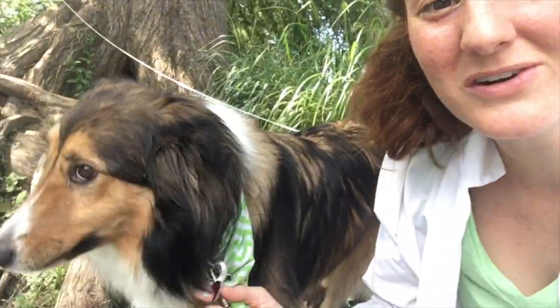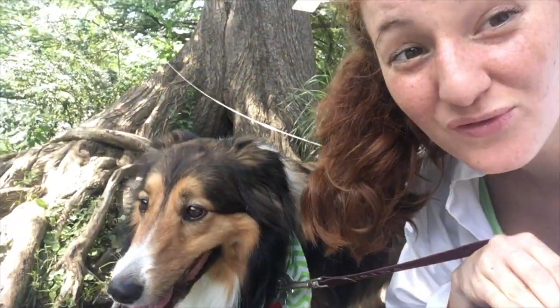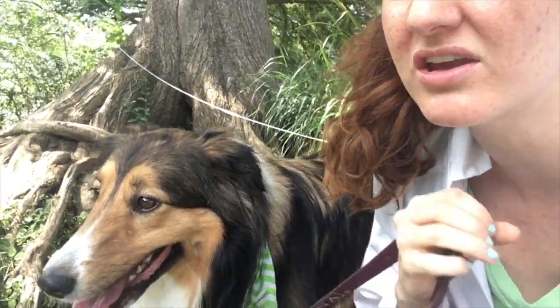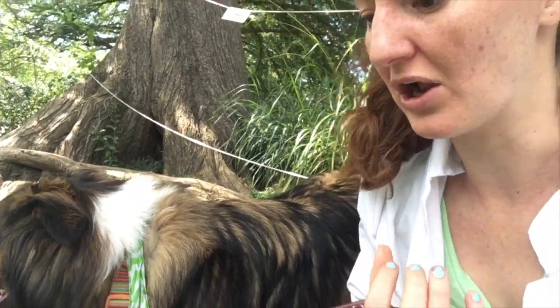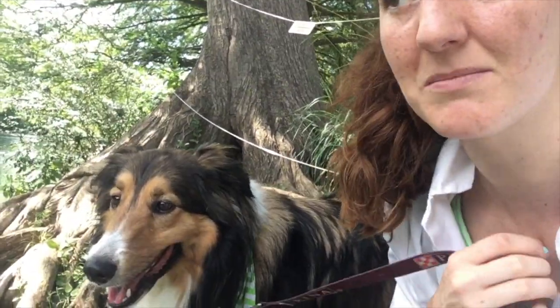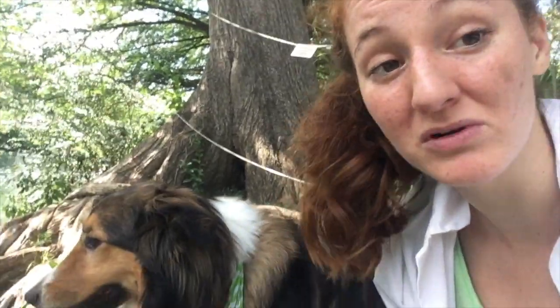That was super cool, Coco. We saw that chemical reaction take place, colors change and precipitates form. It's really cool that you can add a few clear chemicals and find out how much dissolved oxygen there is, cool things to make sure your ecosystem is nice and habitable to other animals.